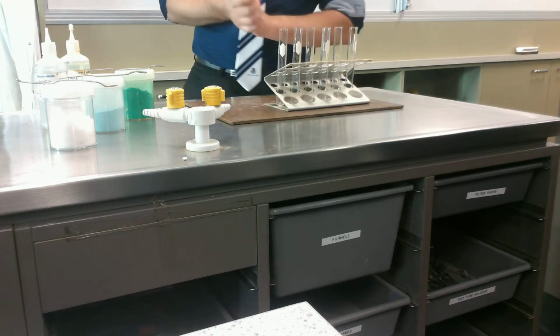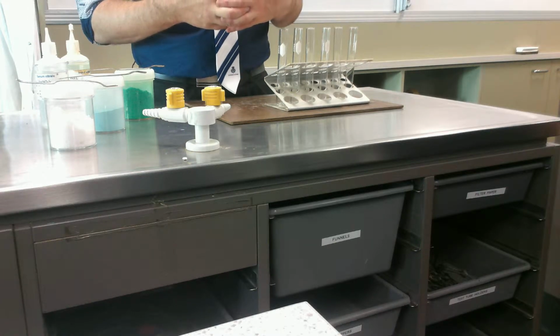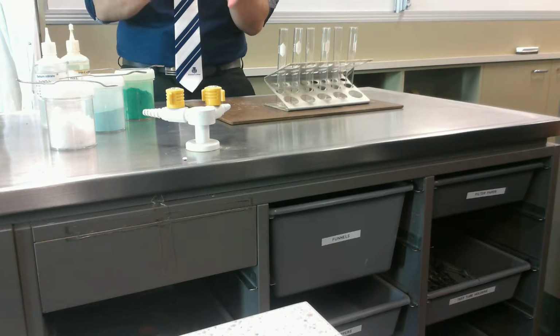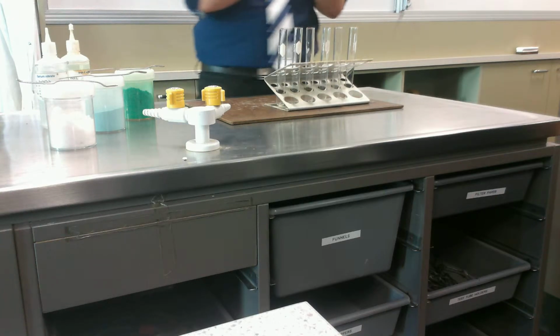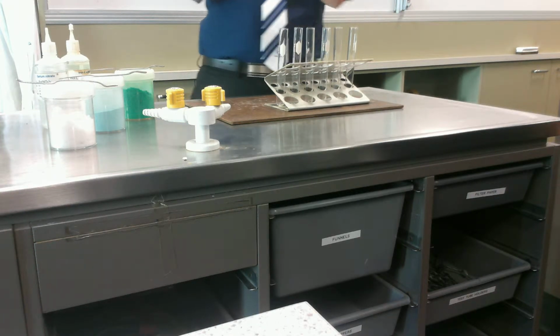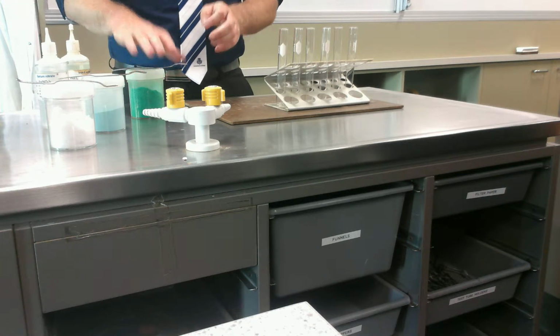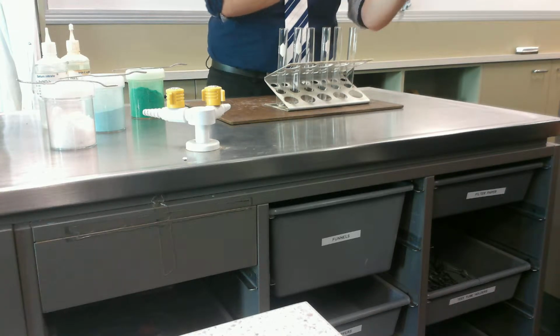So I hope this will be a nice, quick experiment. We're going to use water as our solvent for all of these. Alright, so the solvent is the liquid that we use to try to dissolve things. If the dissolving is successful, it's a solution. If the dissolving is unsuccessful, we call it a suspension. If it's successful, we say the stuff that we put in, the powder we put in, is soluble. If we say that it doesn't dissolve, so makes a suspension, we call it insoluble.